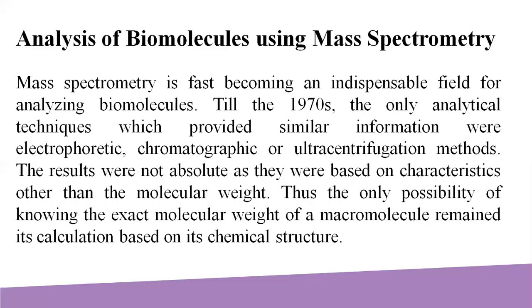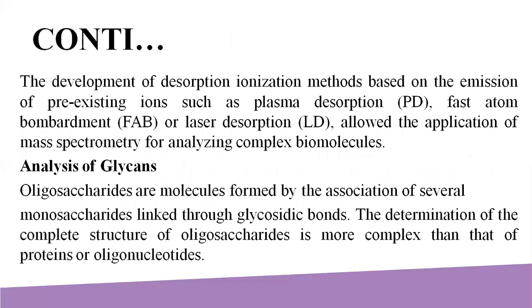Thus, the only possibility of knowing the exact molecular weight of a macromolecule remained its calculation based on its chemical structure. The development of desorption ionization methods based on the emission of pre-existing ions, such as plasma desorption, that is PD, fast atom bombardment, FAB, or laser desorption, that is LD, allowed the application of mass spectrometry for analyzing complex biomolecules.